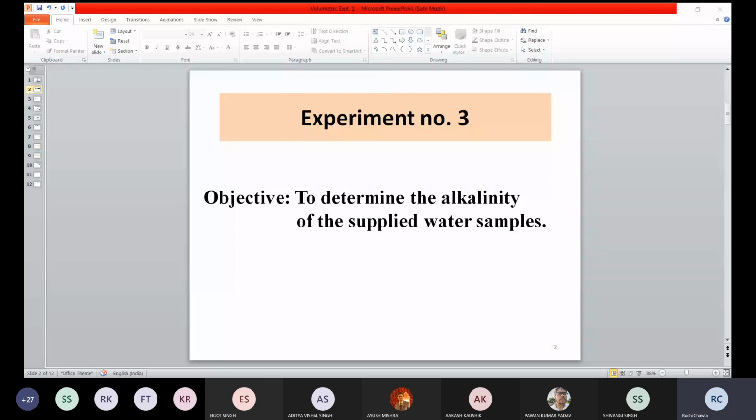While weighing a specific quantity of a salt, why do we need to take the third reading? Means after transference of the salt into the volumetric flask, why do we need to take the third reading after the transference? In fact, one of the students answered this in the class when I was teaching you about this. Yes, because all the salt particles are not transferred. Some particles stick to the walls of the weighing tube. Remember the terms as well, because sometimes you know the answer, but these terms do not come to your mind, and that is where you lose marks in the diagram.